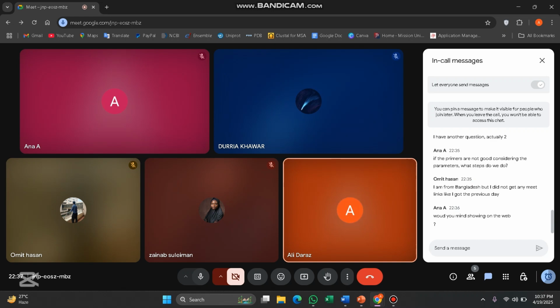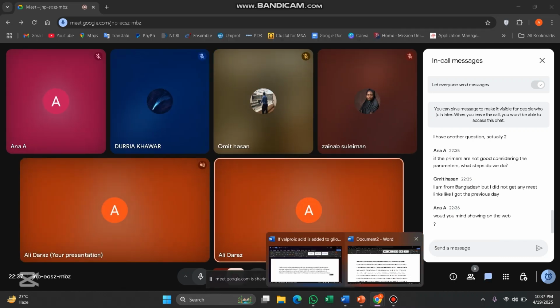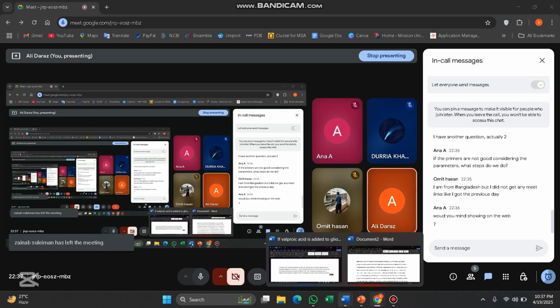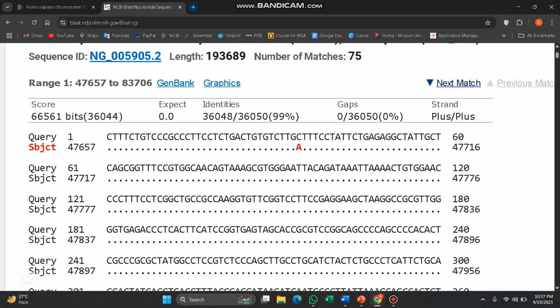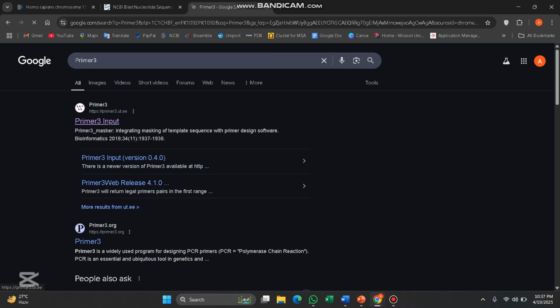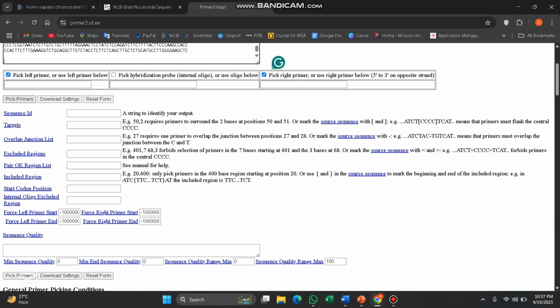Would you mind showing on the web? Okay, I'm going to show you on the web. Like that, just copy and paste it. We just press Ctrl+C and write here Primer3. Like that, Primer3. And we paste here and click on Pick Primers.